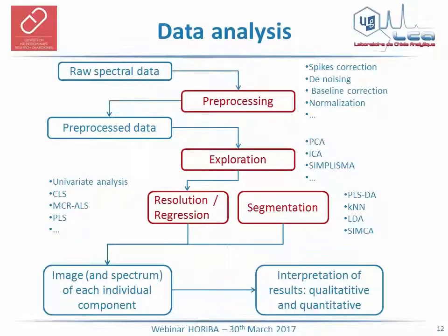More and more user-friendly software are provided directly by the manufacturer, such as HORIBA with LabSpec, in order to help the analyst to manage conventional sample analysis.